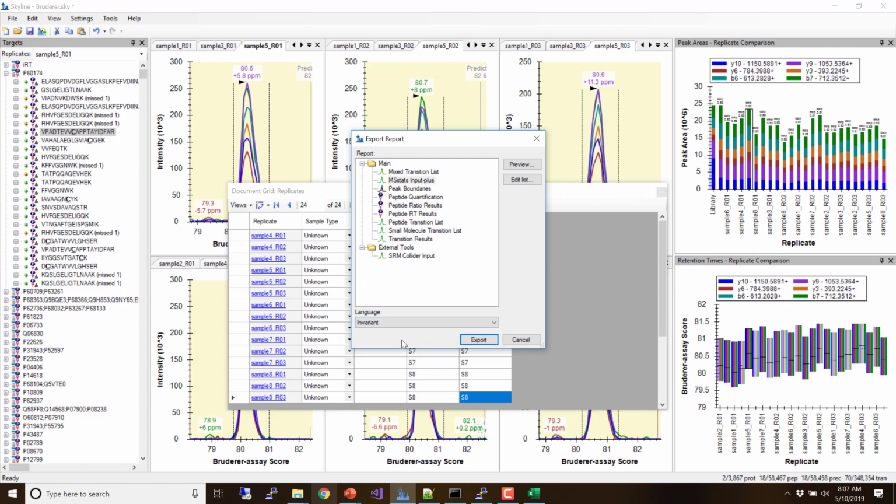And if you're in Europe, you'd get your localized decimal separators and everything. But if you want to work with another tool and you're not sure, or you know that the tool can only deal with US English number formats and titles, then you do invariant.